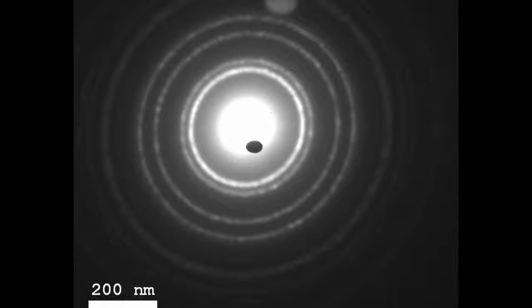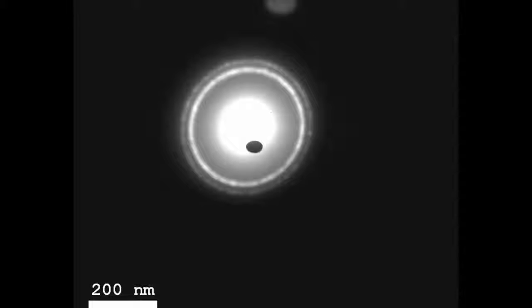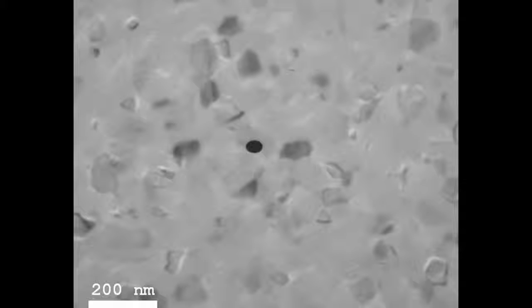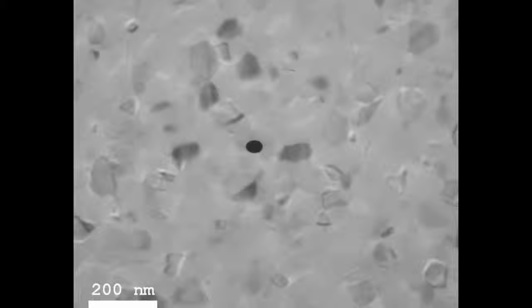If I'm now going to use this objective aperture as you see now and cancel out everything except the central beam and one of the deflected rings here as you see, and then I go back to the image view again, what we will have then is a phase contrast image. You can see it gives some three-dimensional character to the grains. Some edges of the grains will have white regions and some edges will be black, and that makes them look three-dimensional. And how much these white and black regions offset, that depends on the strength of this defocusing of the objective lens.